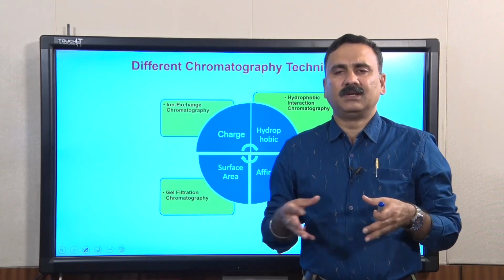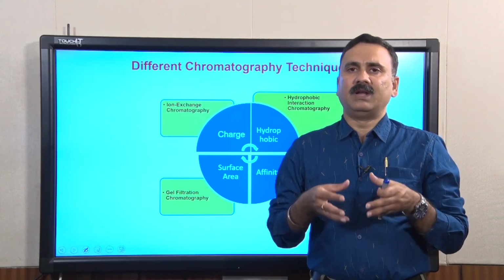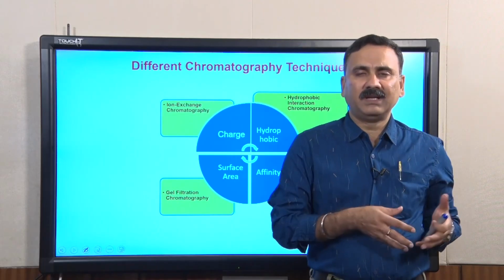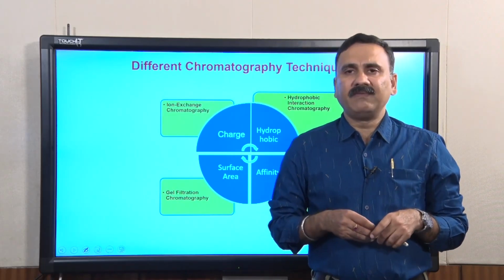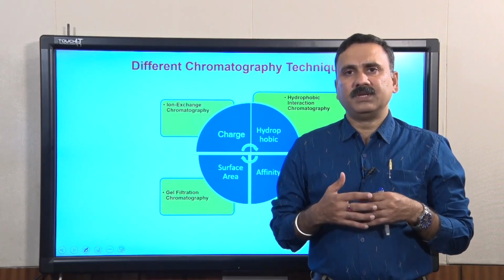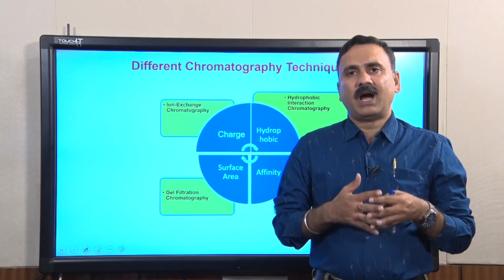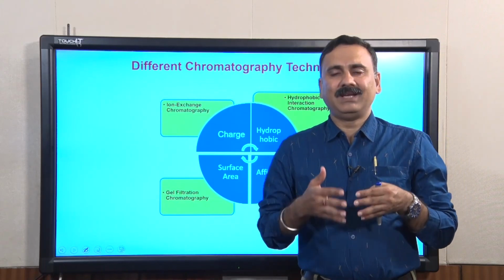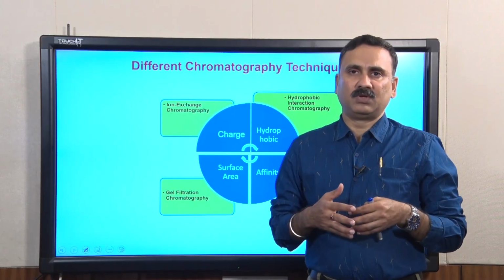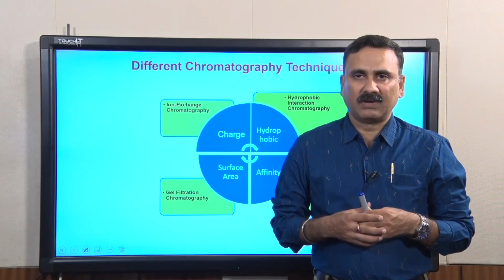components. In this context, so far we have discussed ion exchange chromatography, hydrophobic interaction chromatography, gel filtration chromatography, and in our previous lecture we also discussed affinity chromatography. And now today in this lecture we are going to discuss the different types of affinity chromatography and how to perform these chromatography, and at the end of this lecture we are also going to discuss the application of affinity chromatography. So, let us start with the first examples of affinity chromatography.